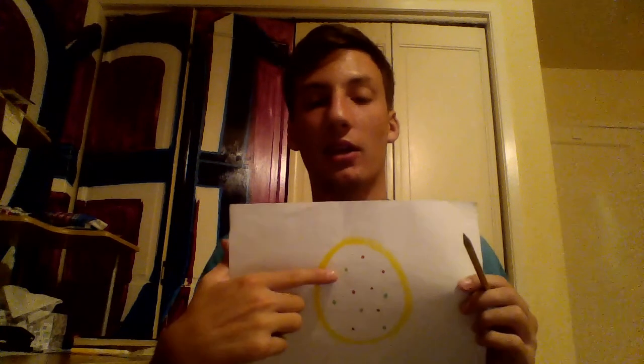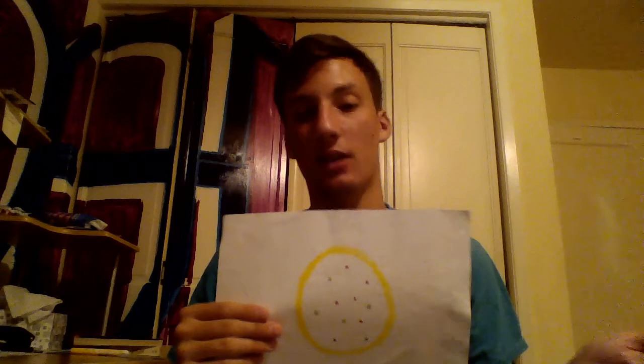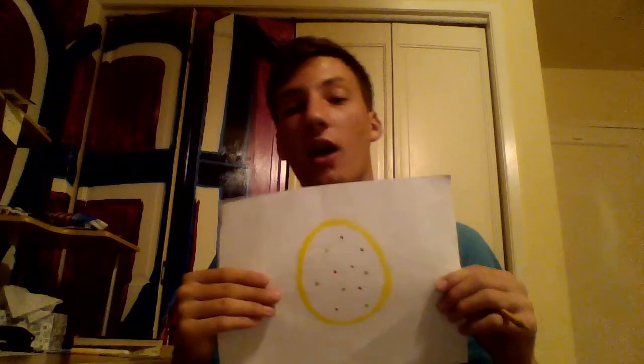And so one thing to keep in mind here is that within each colony there's only one insert, which means there's one specific set of nucleotides that we got from our 1,000 base sequence. So let's say we want to clone our DNA, we want to amplify it, we want to copy it.